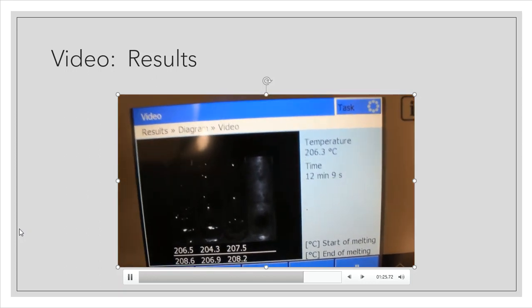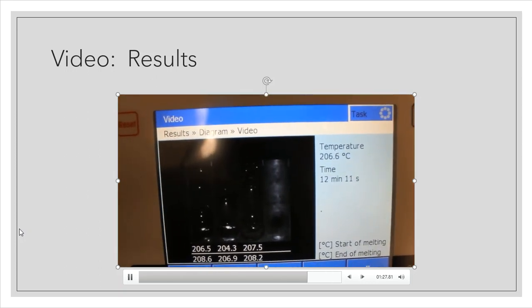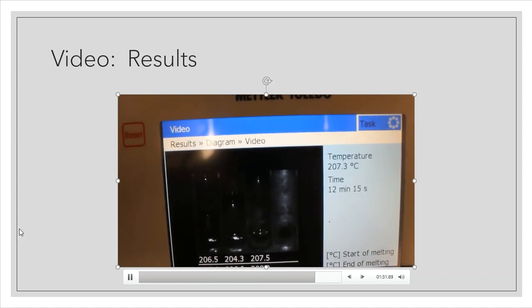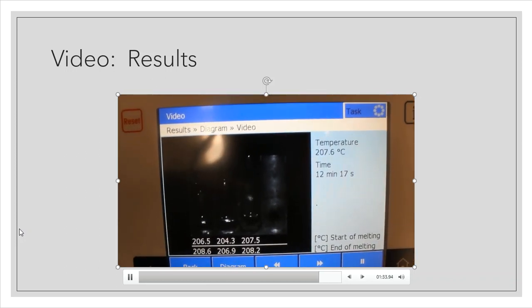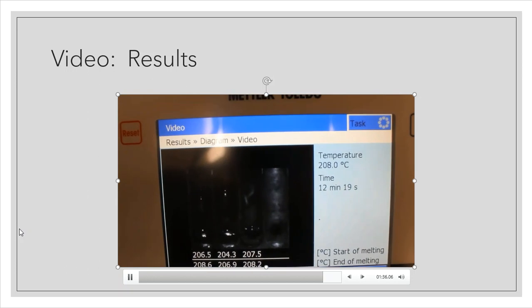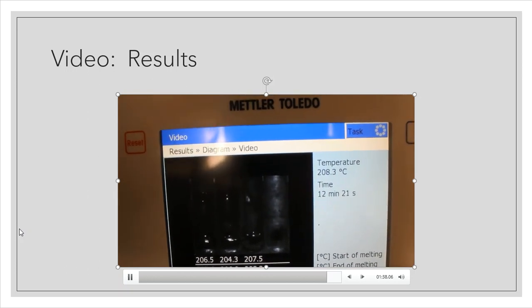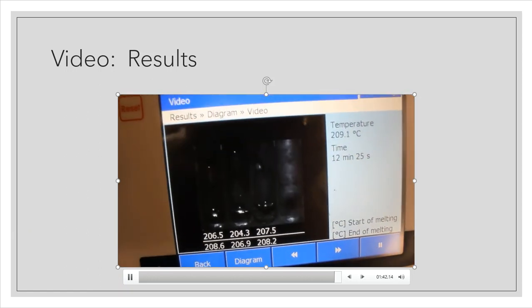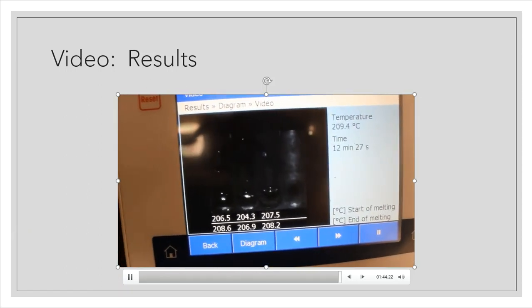That's when the laser actually can make it through completely. So the laser sometimes lags behind your eyeballs. So this machine does a pretty good job in giving us a melting point, but honestly, sometimes we can do a better job than this machine can just due to the engineering aspect of how this thing works.